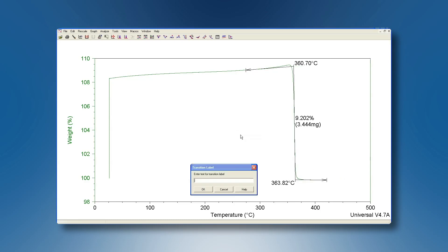The intersection of these two tangent lines, the extrapolated endpoint, corresponds to the Curie temperature.